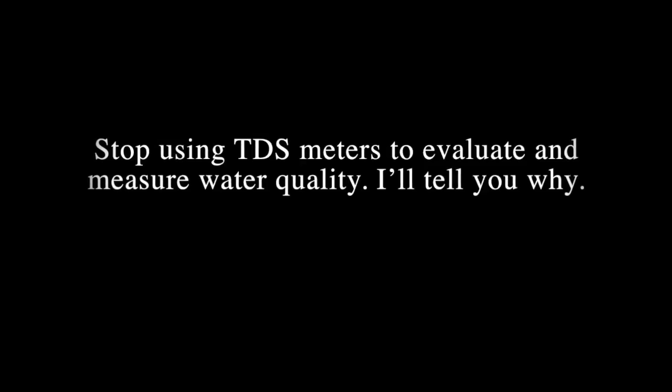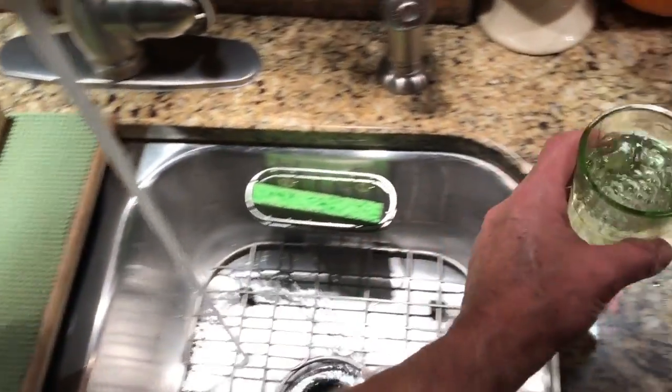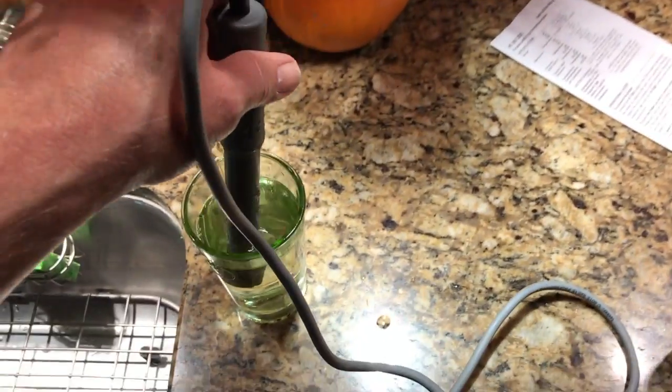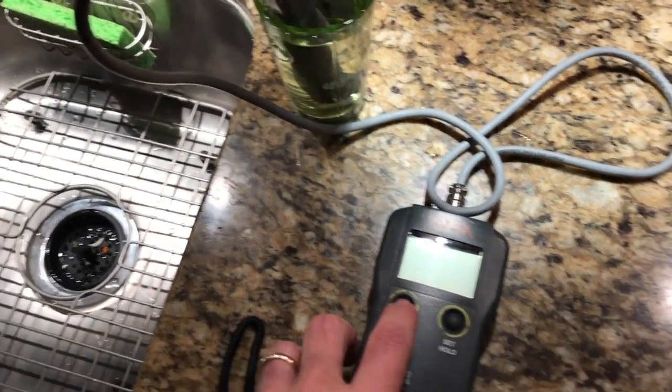Hello everybody, this is Dr. Kevin Novak again. I'm going to talk about TDS, or in other words conductivity. As we all know, if you have distilled water or deionized water it could have a conductivity of zero. What I'm going to do here is measure my tap water and you'll see how low it is. The conductivity measurement in my aquarium is 220, and this conductivity measurement reading right out of the tap will be 101.